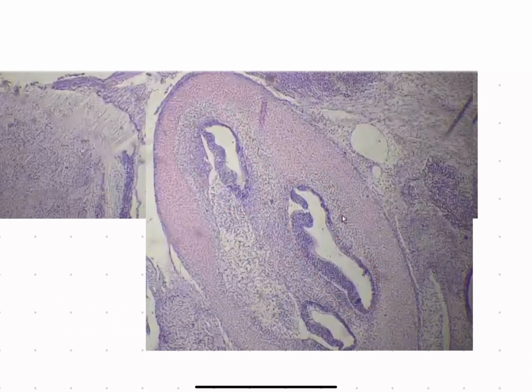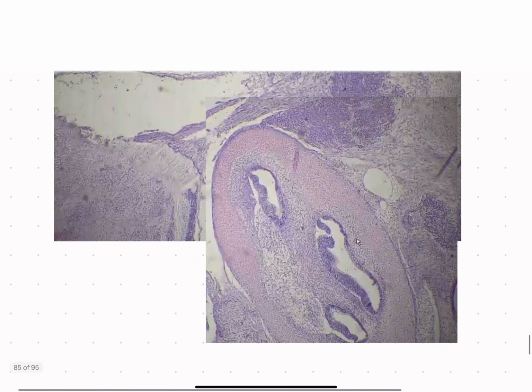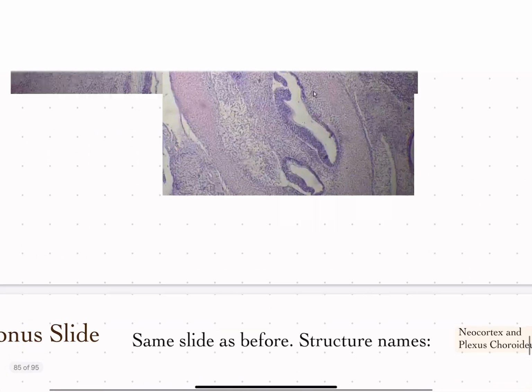These openings depend on what the professor thinks, but I would go with the developing cochlea just to be on the safe side. You could also make a point that these are semicircular canals. Maybe not, actually. Developing cochlea is just fine, I would say.